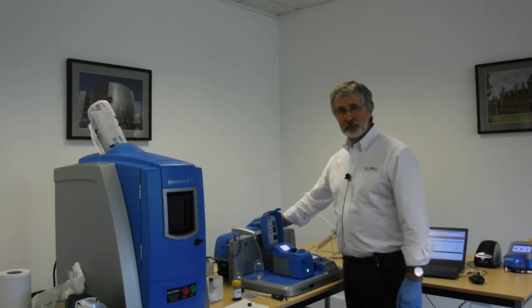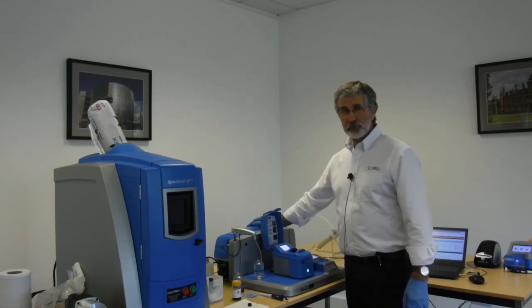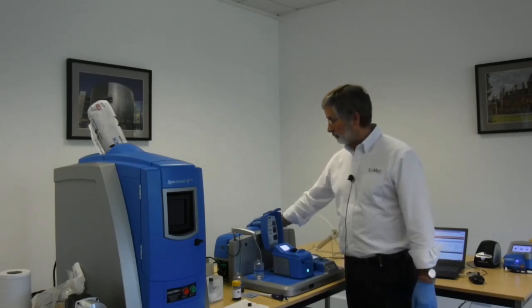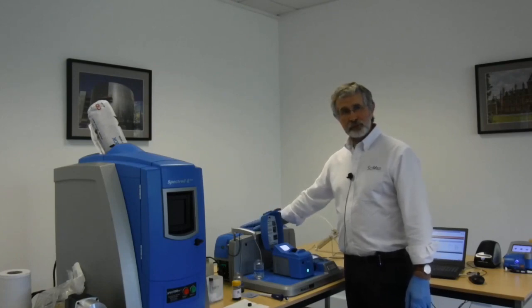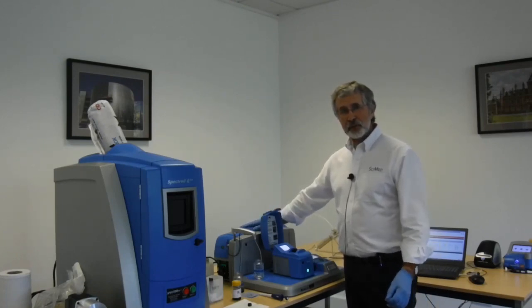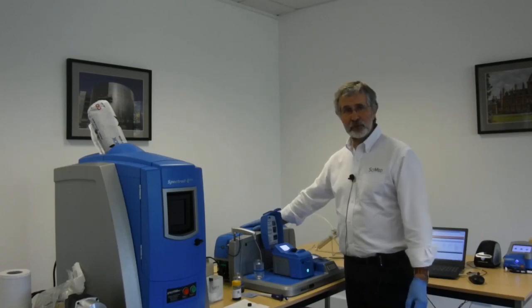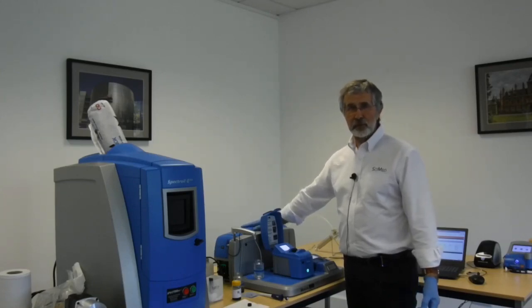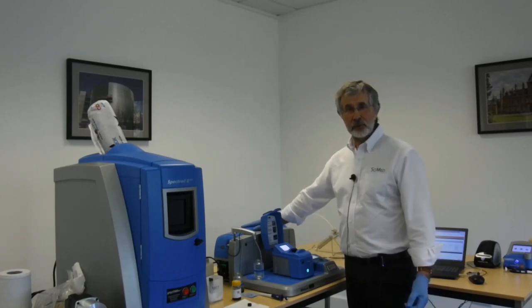Now this one will count the particles. Anything from 4 microns up to a cutoff of 100 microns will be counted, and the results displayed in total counts and also in the ISO codes or other codes if you wish, like NAS and so on. Then it will image the particles and categorize them into their classical wear shapes, like cutting wear, sliding wear, fatigue wear, non-metallics even, and even fibers. It's a very useful diagnostic tool. Finally, it will give a total ferrous debris analysis and also a percentage of large ferrous as well.